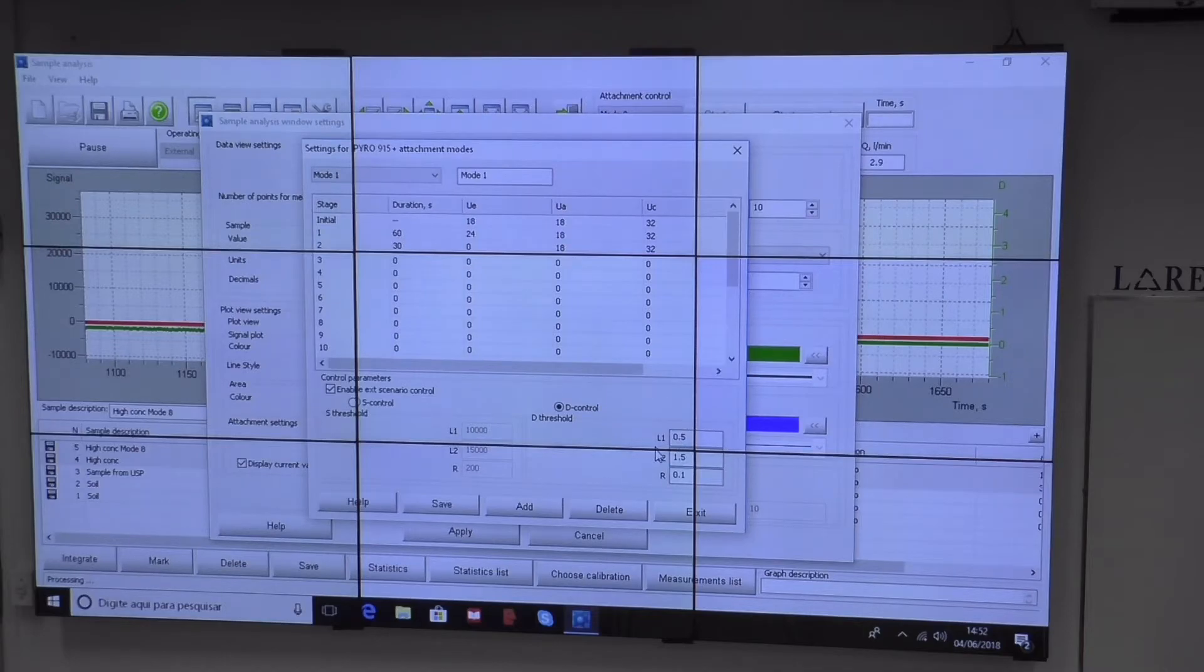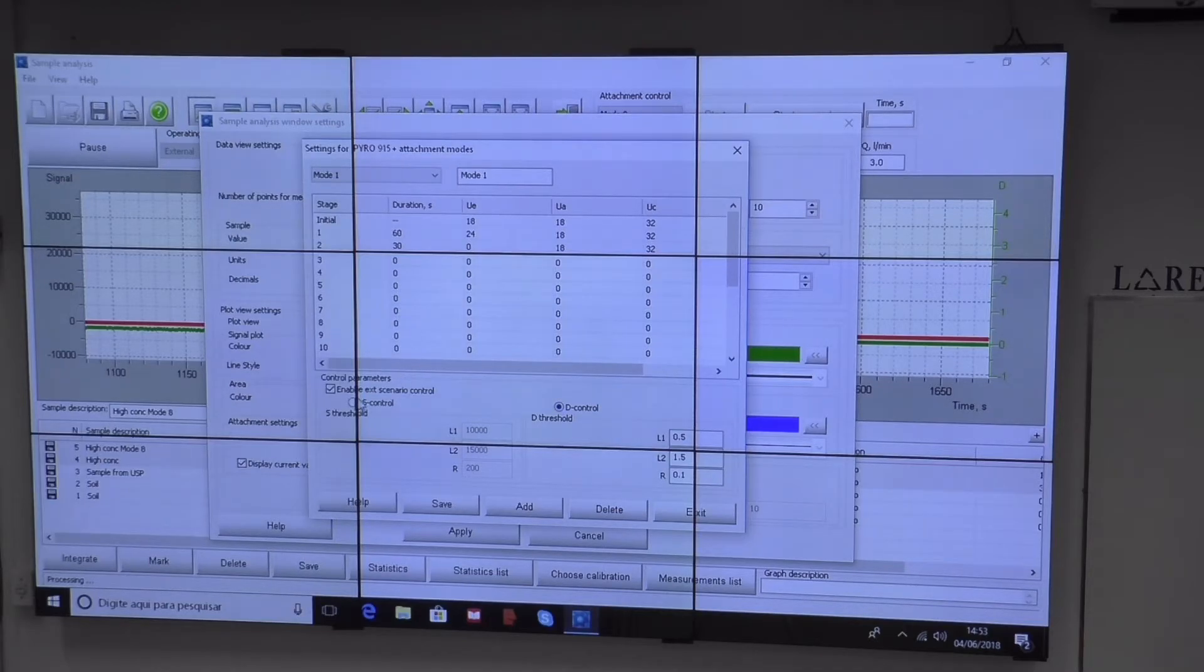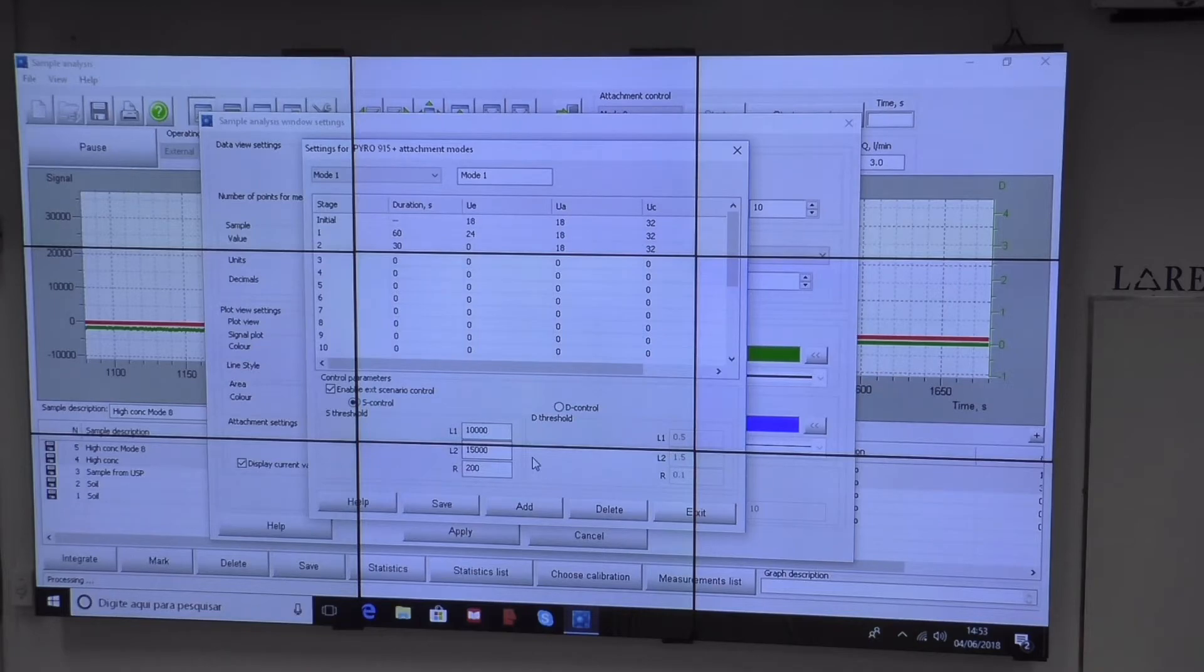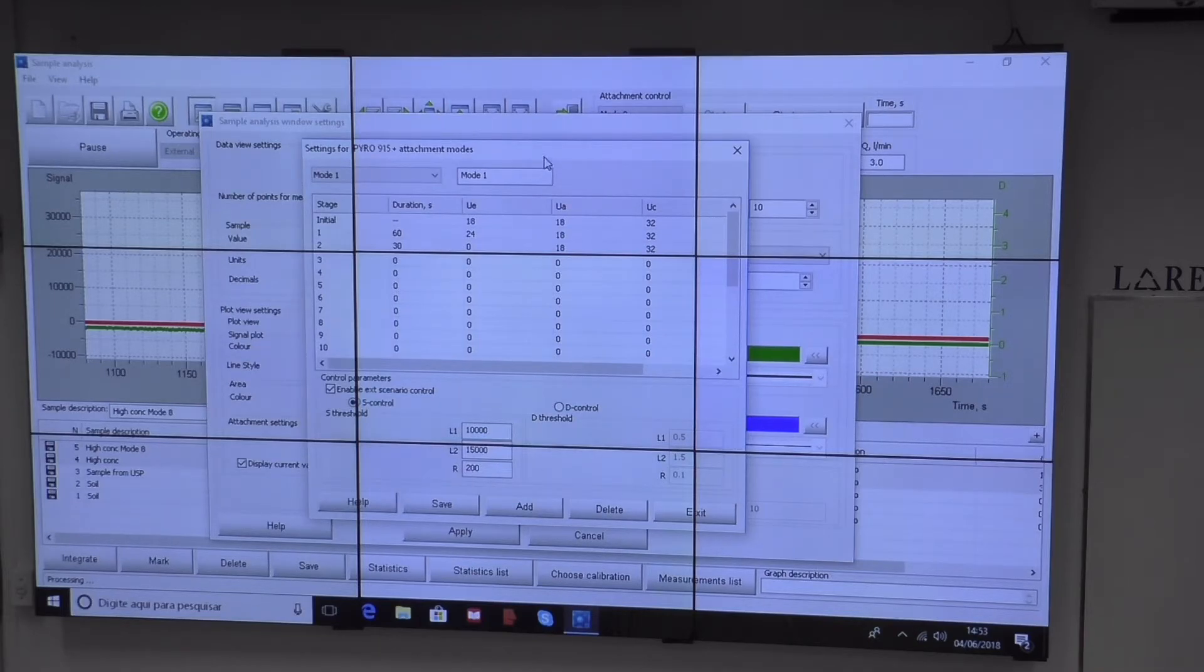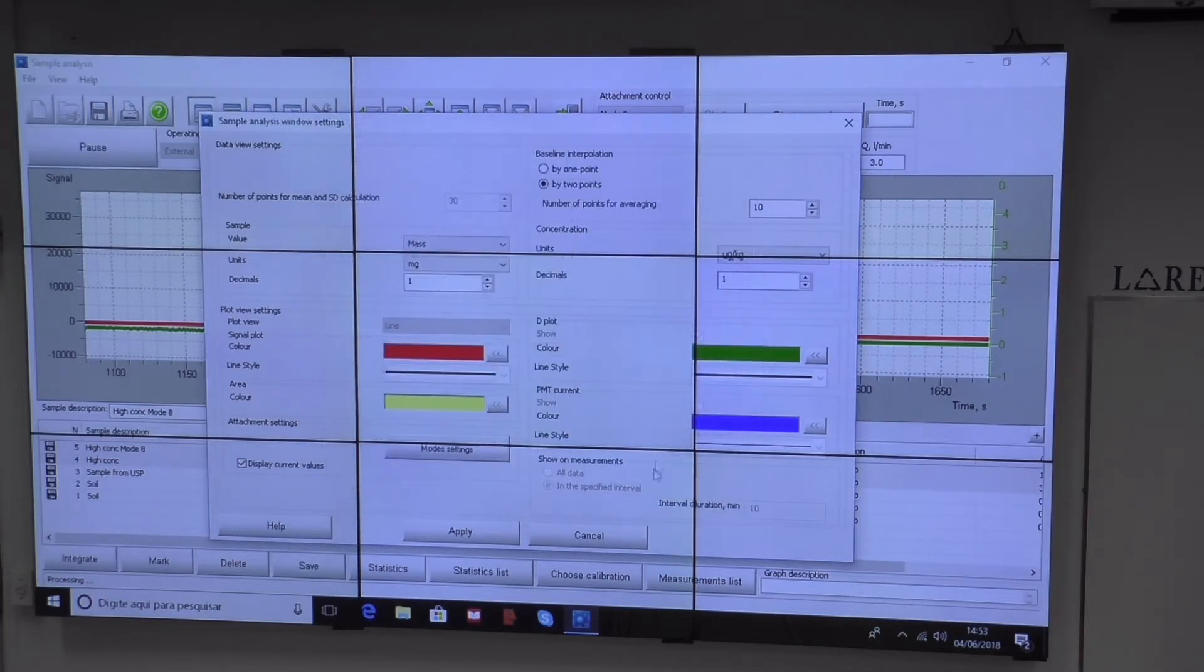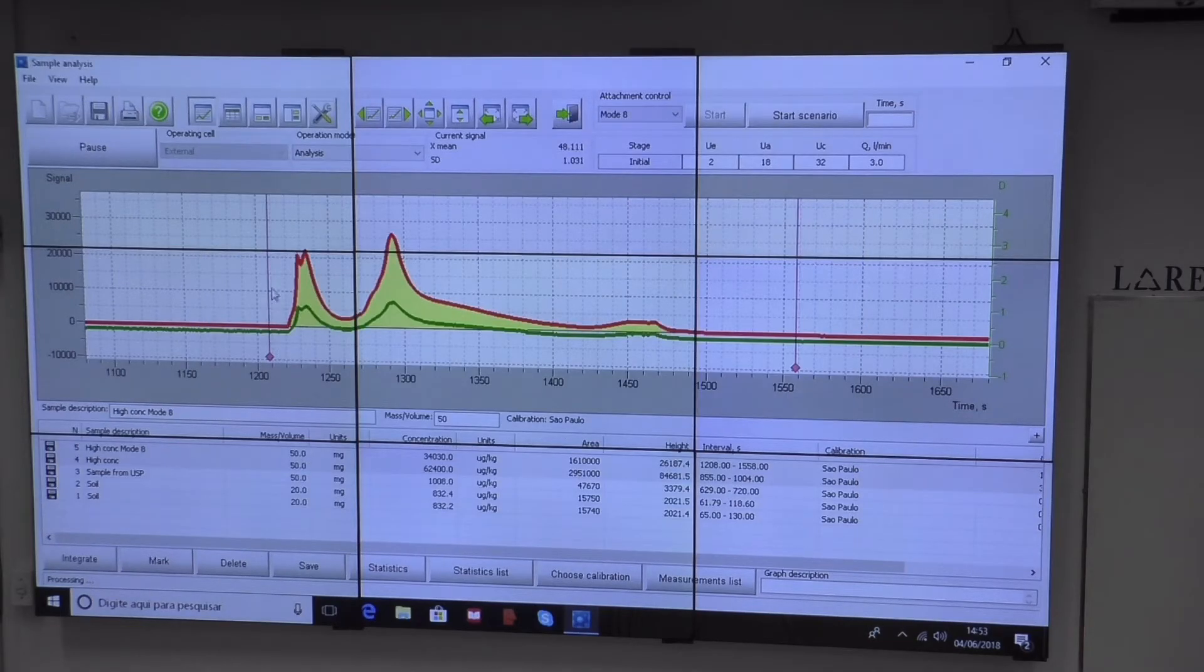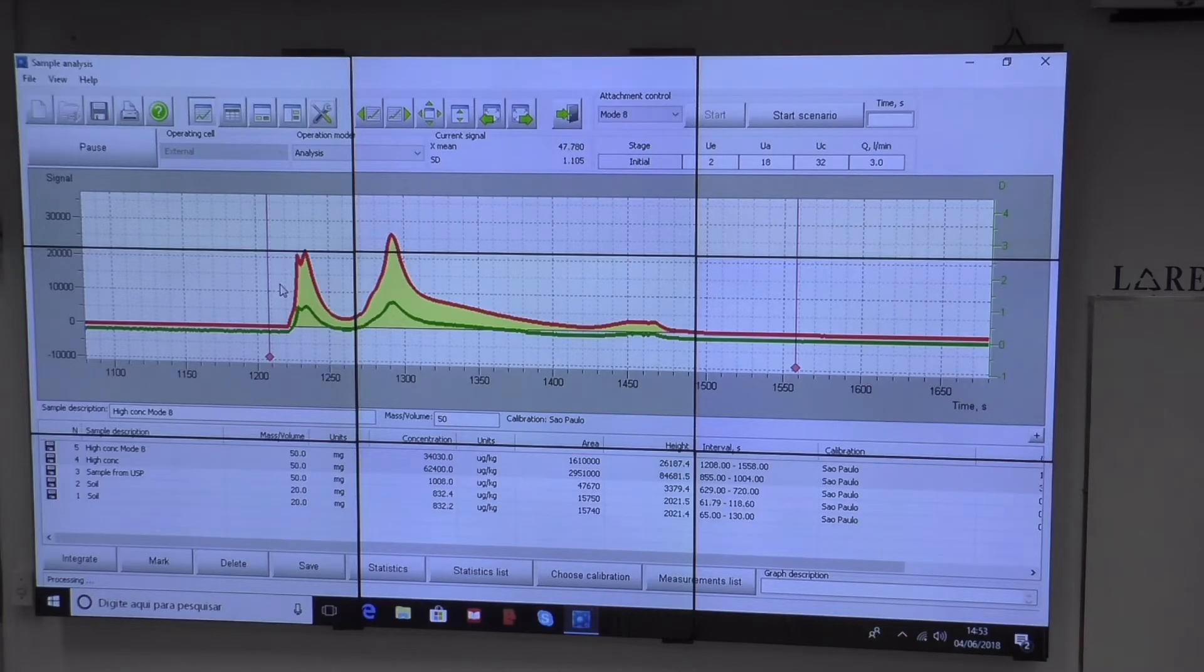D-control we usually use for rich organic samples like crude oil, and signal control for high concentrations. The system reacts to this with all of these parameters. Questions?